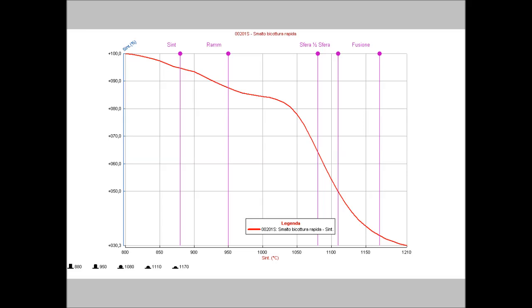The data gathered during the test can be seen as a plot. This is an example of the softening plot of a glaze. The lilac line on the plot shows the temperatures of sintering, softening sphere, half sphere and melting which are identified automatically.